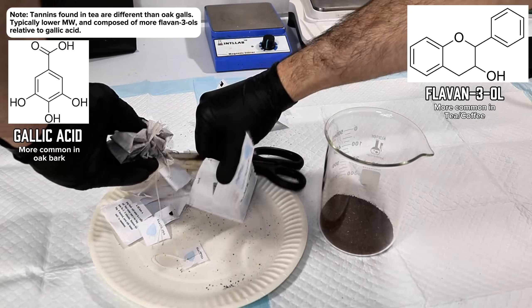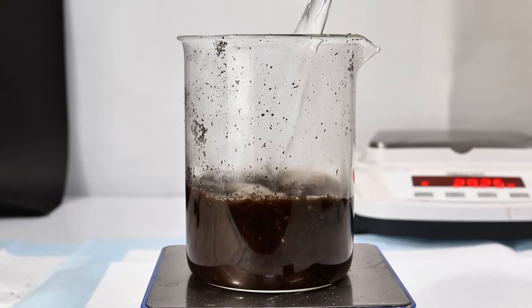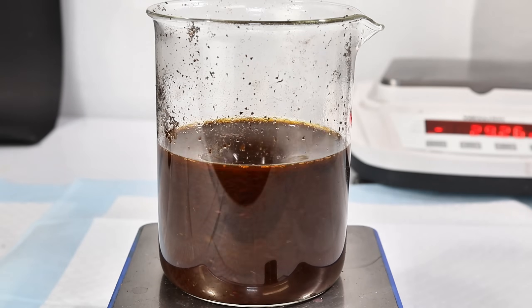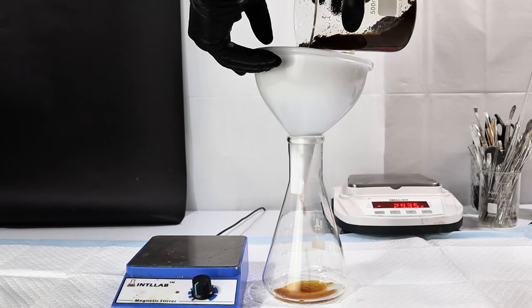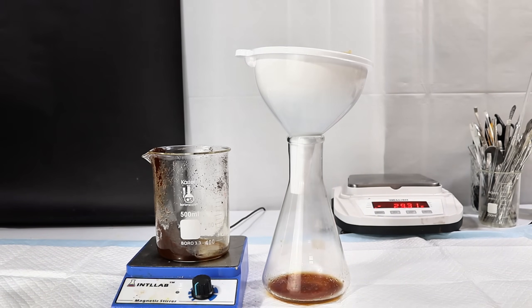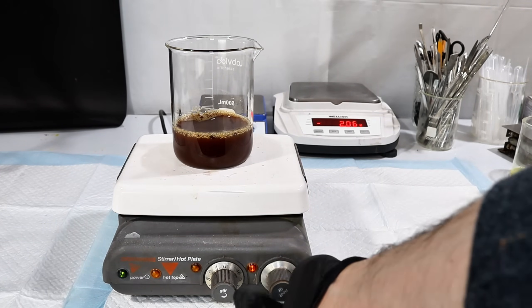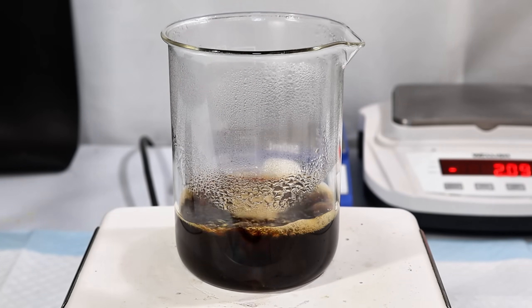To extract the tannins from the tea, I began by cutting the bags open, pouring out the contents into a beaker, and then pouring in some boiling water. After allowing this to steep under constant stirring for about 30 minutes, I next filtered off the tea leaves and boiled down the filtrate to around a third of its initial volume.